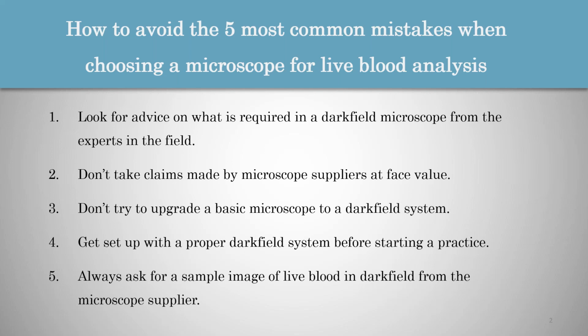And this is not because microscope suppliers are deliberately misleading people, but purely because they are not involved in the field of live blood analysis. They simply don't know what specifications or features are required. And manufacturers or microscope suppliers simply assume that any dark field microscope would be suitable, which absolutely is not the case.